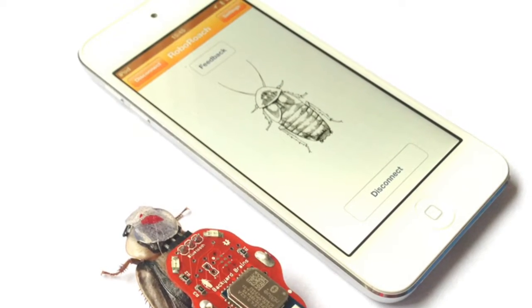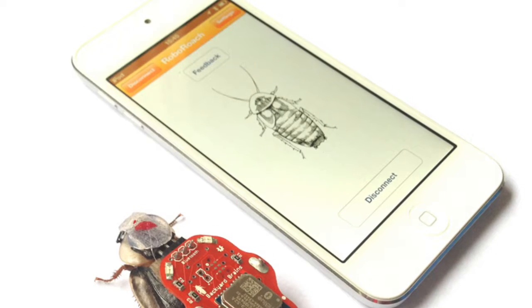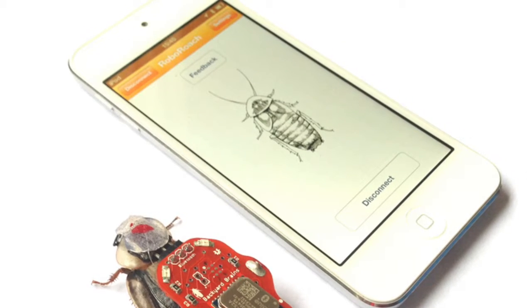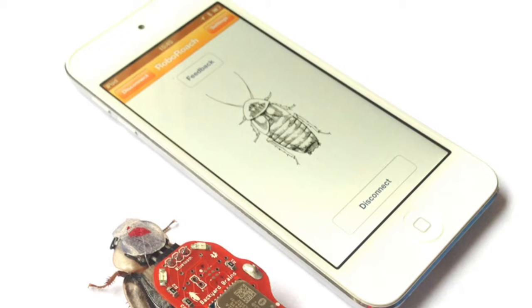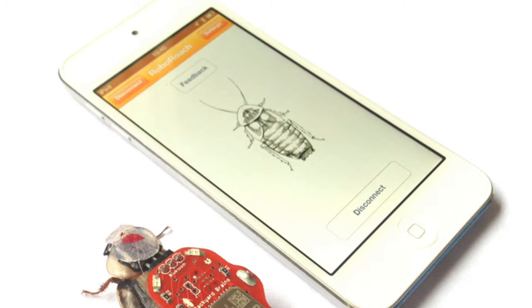Plug in the connector the next day and hot glue it onto the cockroach so it stays on when walking. Download the Roboroach app and connect it to your connector. Turn it on by pressing the small black button to turn on the microcontroller and connect it to the device.